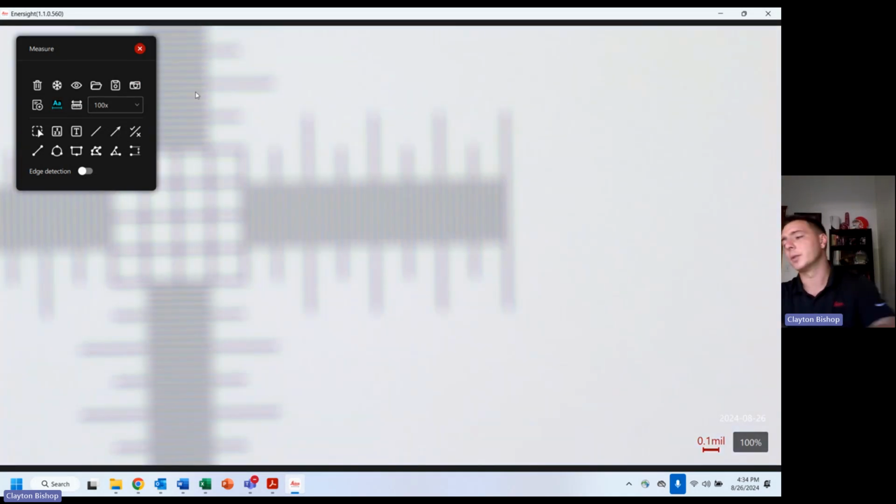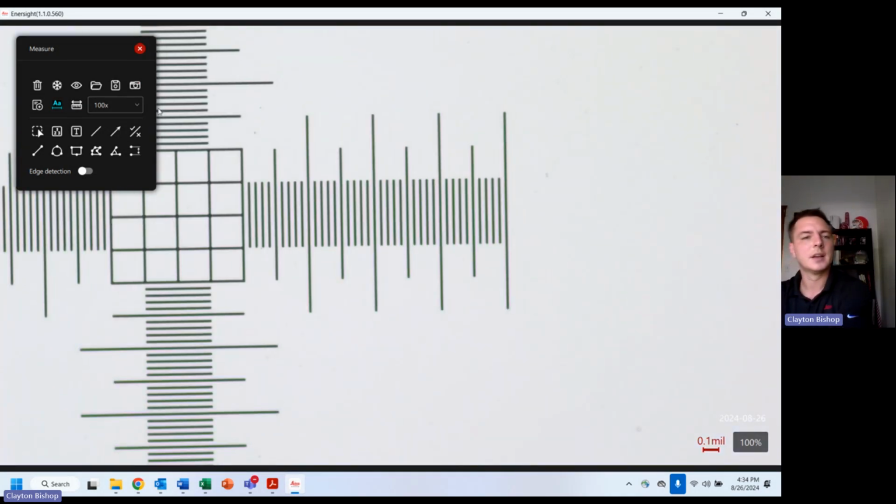Now it's a manual microscope. So when I switch back to 10x, I need to select my 10x right here. And then if I take a measurement, say from here, 100, 200, 300, this should be 400 microns about. Nice. 396.76, just shooting from the hip.